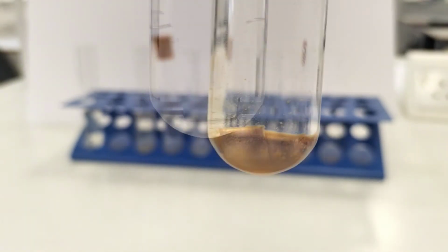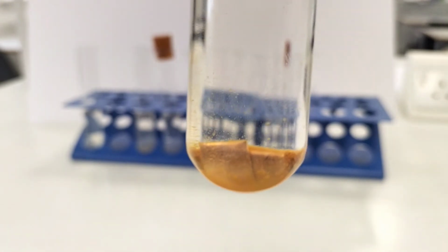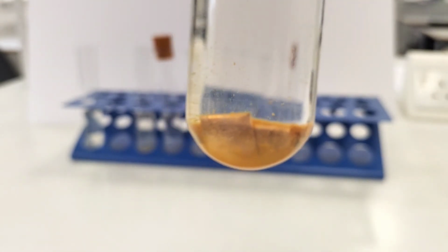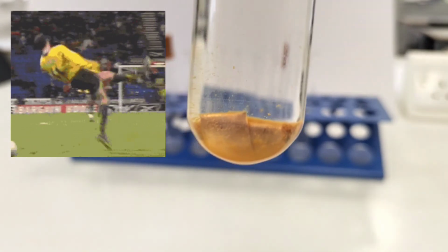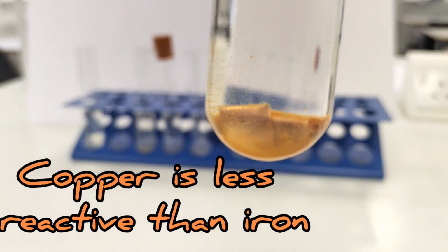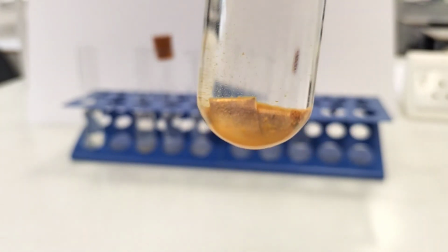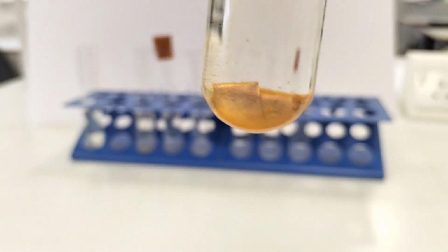And finally, experiment 8, where we used copper metal wrapped around the iron nail. And oh dear. If our objective was to reduce the rate of rusting, the extent of rusting, then this experiment has genuinely been an epic fail. And it stands to reason that using copper rather than zinc and magnesium was a very bad idea. Copper is less reactive than iron, and therefore in this particular case, the iron itself is acting as a sacrificial barrier for the copper.